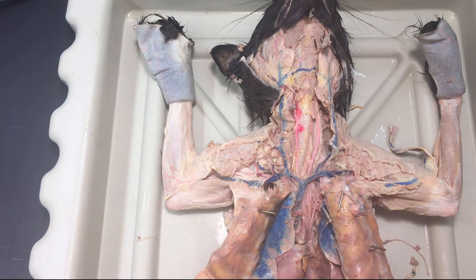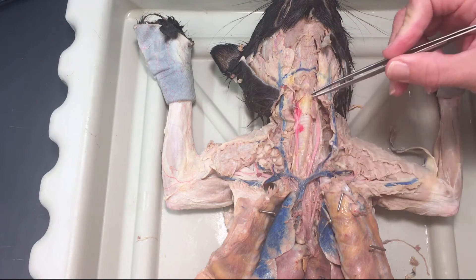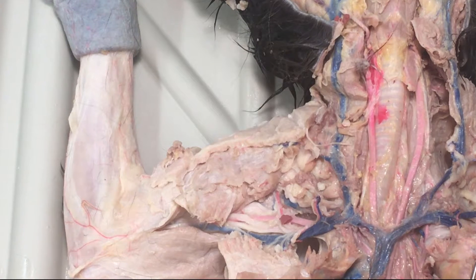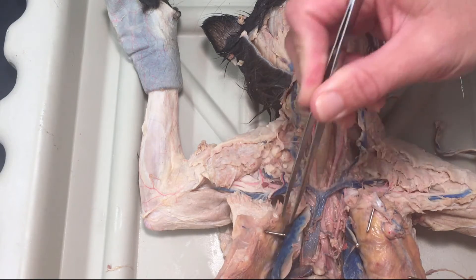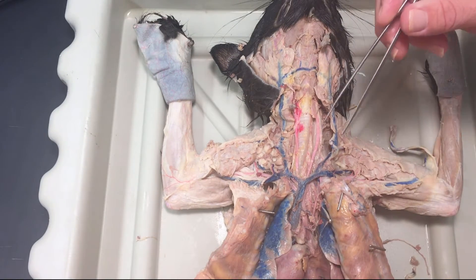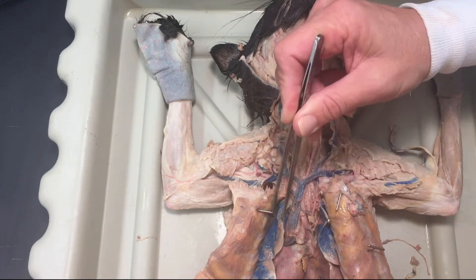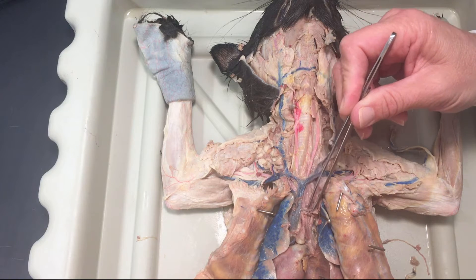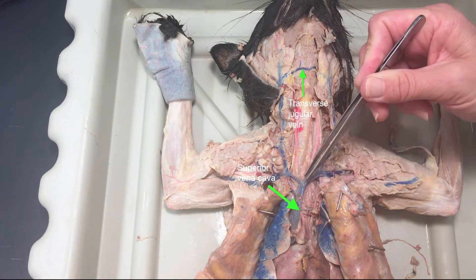I'm going to go over some of these vessels that are here around the neck of the cat and going down the arms. We're coming up from the heart here. We've got this blue blood vessel, so I'll go over the veins first. This, probably not surprisingly, is the superior vena cava, or the pre-cava.